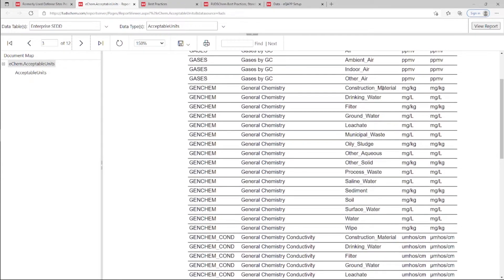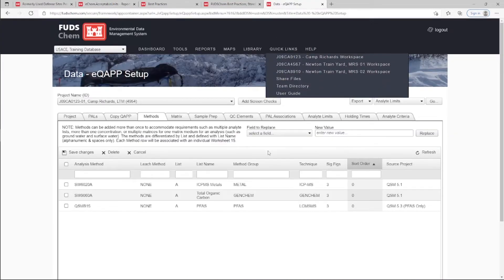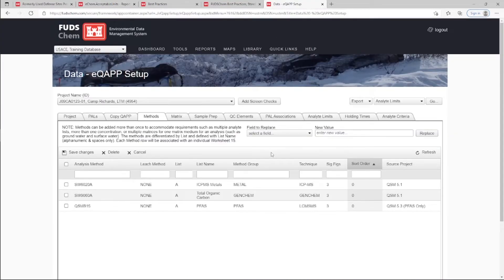The EQUAP Setup tool has a screening check to help catch Method Group, Matrix combinations that do not have Acceptable Units established and therefore do not show up on the report.